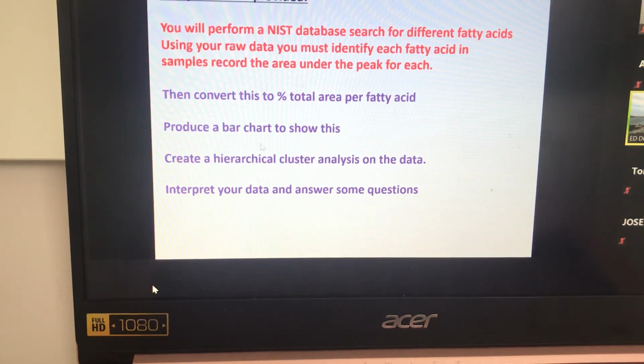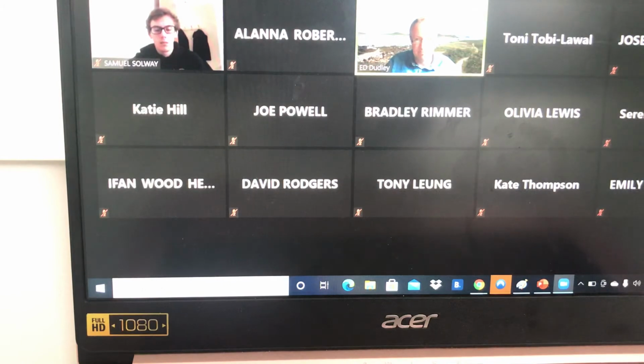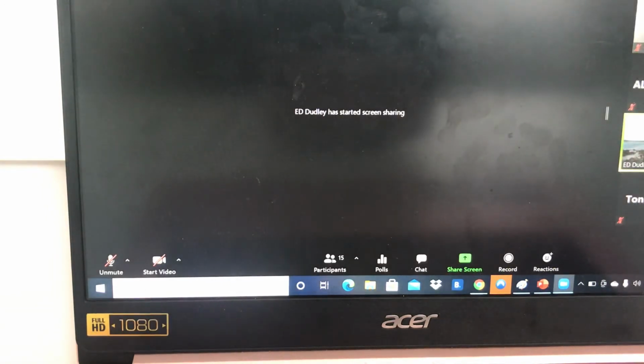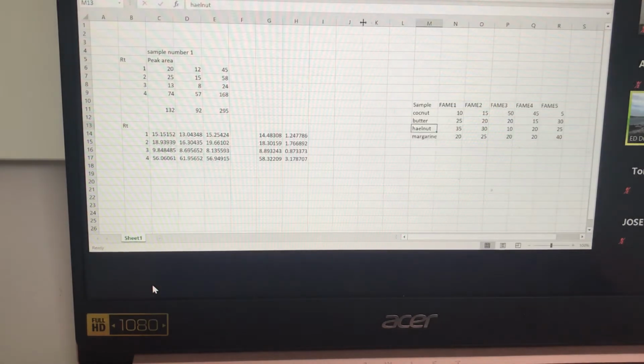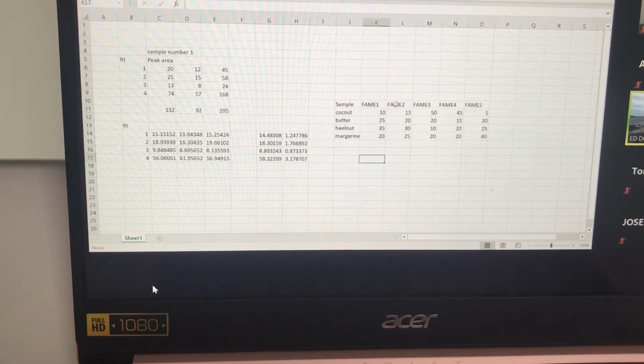The next thing I want you to do is something called a hierarchical cluster analysis, which I will quickly show you here. So, what you'll do, if I could spell it would help. Let's move that over. Move it back over here. Okay. So, let's spell things properly. Coconut. Hazelnut. Right. So you're going to have 10 samples eventually, and I want you to arrange 10 samples in rows.